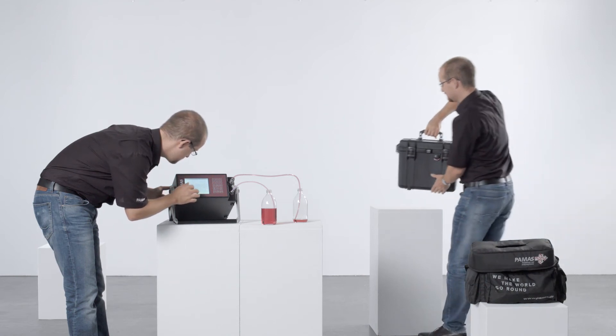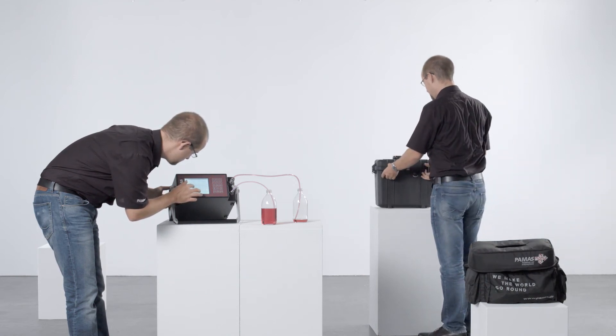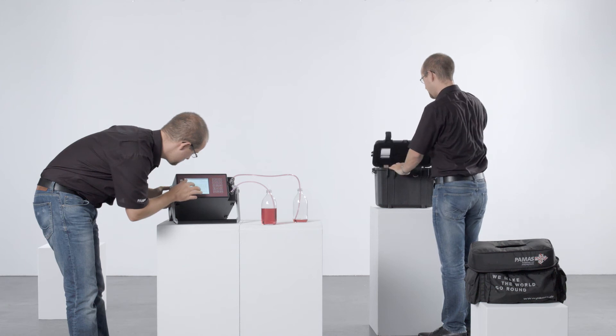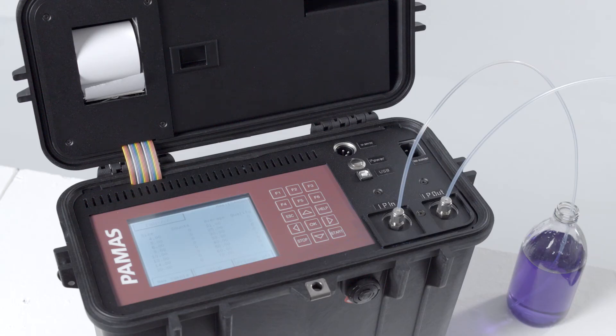The PAMAS S40 is available in a variety of product versions for different applications, including oil, fuel, water, water-based hydraulic fluids and other chemical fluids.